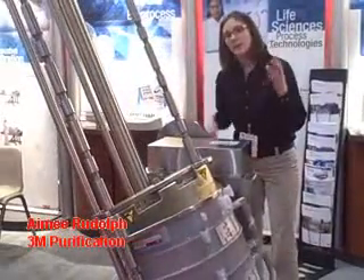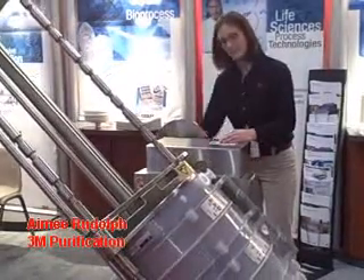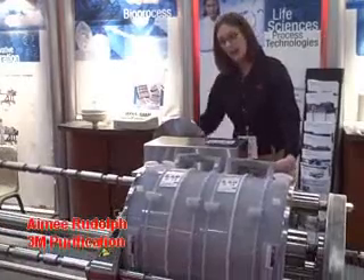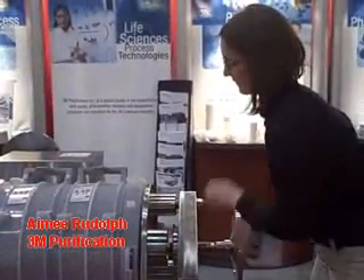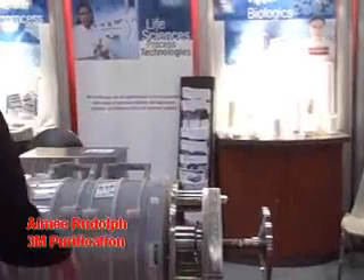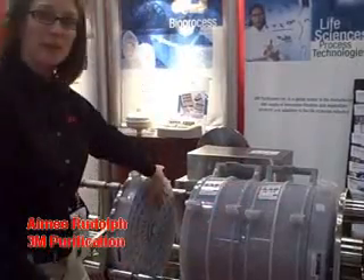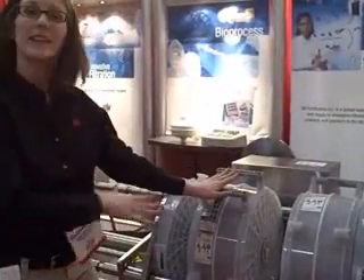This way, there's no bending over and reaching up in order to fill or load the holder. Any fluid that is left inside the capsules will fall to the bottom of the capsule when you have it back in the horizontal position to unload, and the only place the fluid can escape is from the very center of the capsules. At the end of your run, you take your manifold off, throw it away, disconnect your capsules, throw them away, and there's no product remaining in the holder.